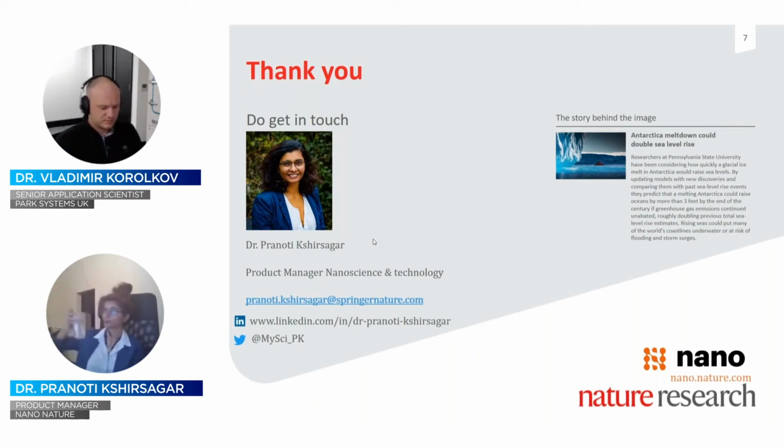We've also then had some questions that have come in specifically for Vladimir. So firstly, for Vladimir, a question from Prasanth. What should be proportional gain and integral gain for a good image?